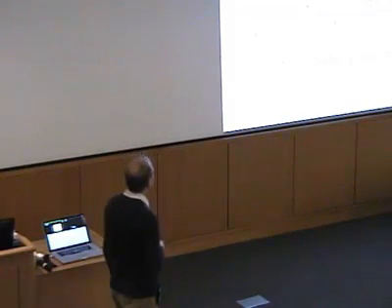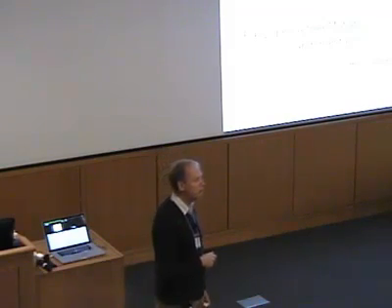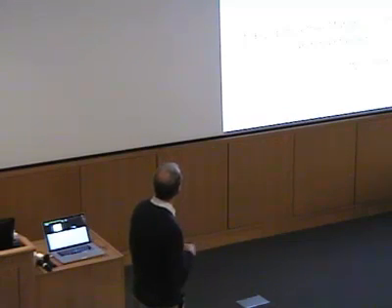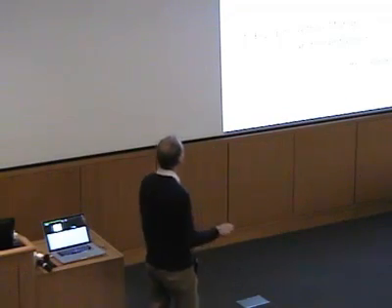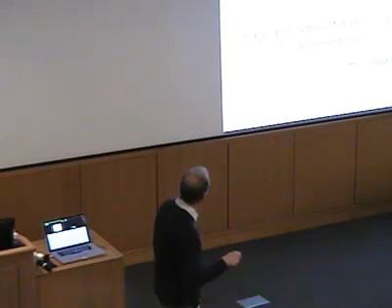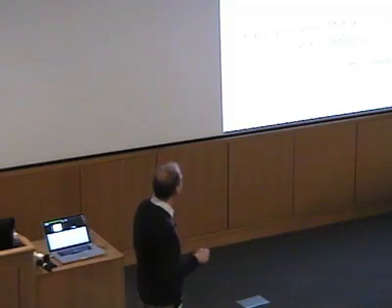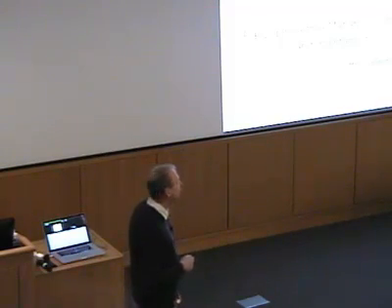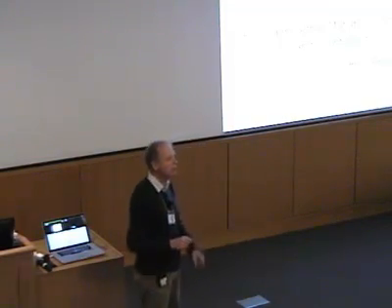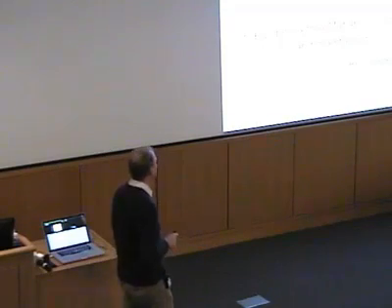Just as an example, here is a verdazyl radical. This is a stable radical. It's a relatively small molecule. We have 4 nitrogens and 6 protons. Its spectrum here, you can see, has really quite a large number of lines. There's a lot of structure here. Getting the hyperfine couplings out, even for a simple molecule like this, is quite complicated. And we typically would have to calculate the spectrum and adjust the hyperfine coupling constants until the calculated spectrum and the experimental one match to get the values out.